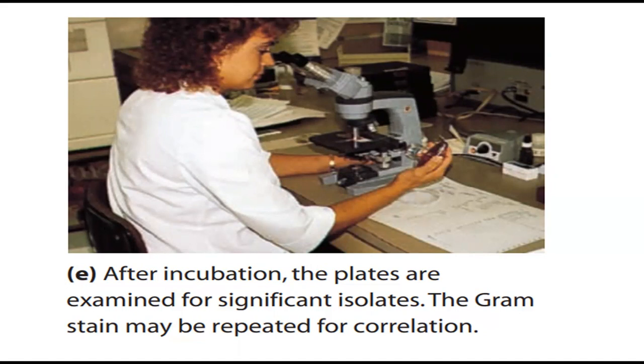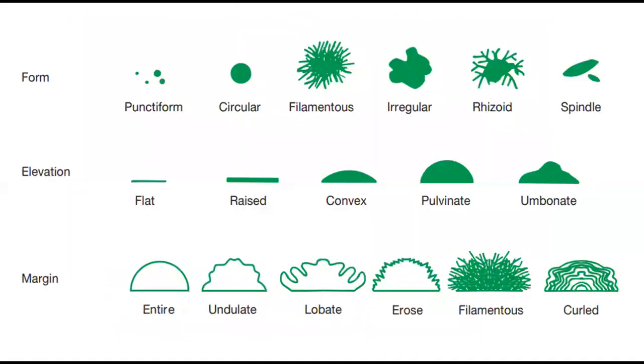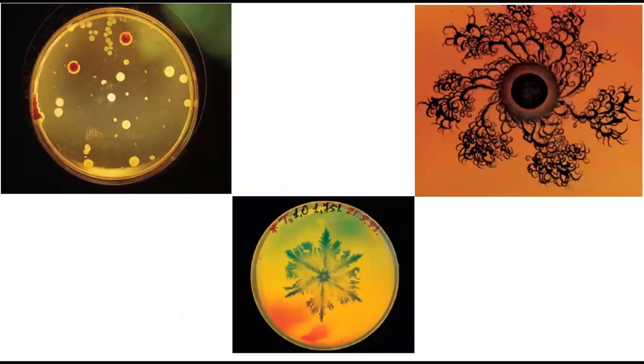So through the microscope you can detect the motility and the actual morphology of the microorganism, and by the naked eye, looking at the slide or the petri plate, you can detect how the colony has formed. From this information you can get sufficient information about the microorganism, but it is not enough for this.